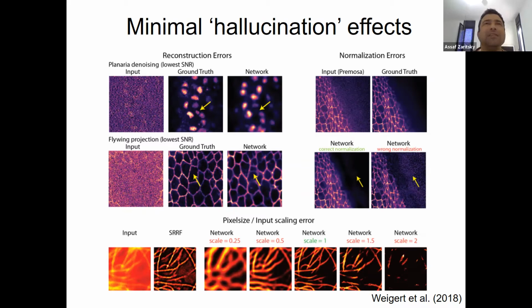If we are doing cell tracking or something like that, and this causes us to miss a cell or to add a cell and we get more mistakes, that's fine. We are going to have mistakes anyway that we need to deal with. We just need to quantify that and see that it's not too much. But there are other applications of this mapping, which I hope I'll get to today, where you cannot rely on the reconstruction. You need to be super careful about any biological insight or biological conclusions that you get from these reconstructed images. You can see other types of errors, reconstruction and background errors.